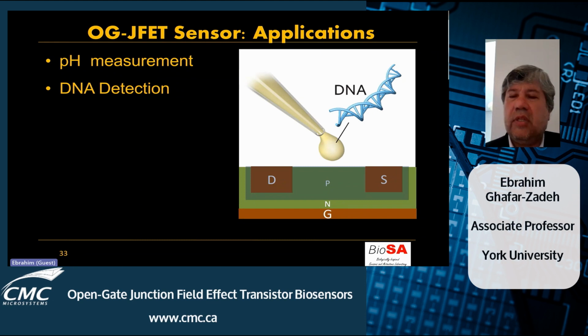So indeed, for DNA storage applications, we need to store, for example, a specific volume of DNA for sensing purposes. Sorry, for DNA storage purposes, or for other applications. Let's say, for infectious disease detection, what is detected is a specific gene or a specific sequence of the DNA.